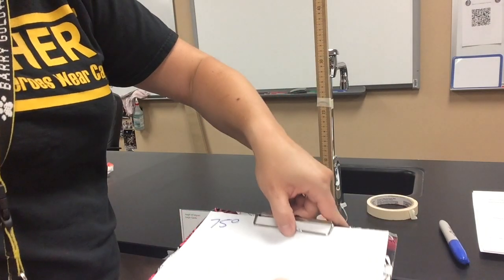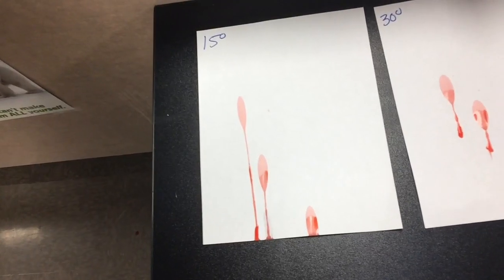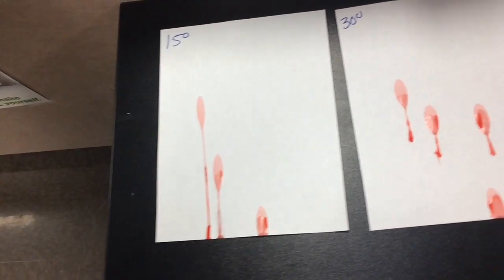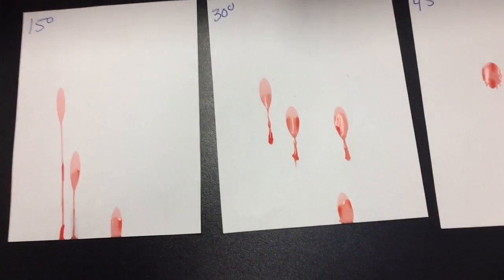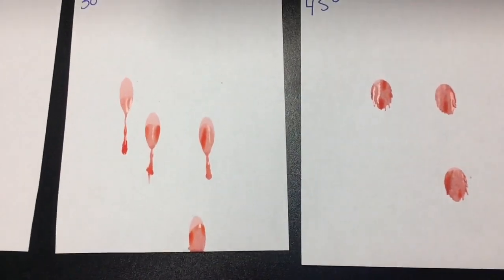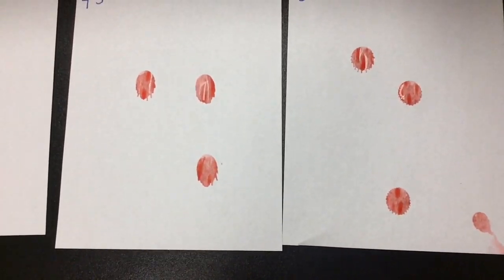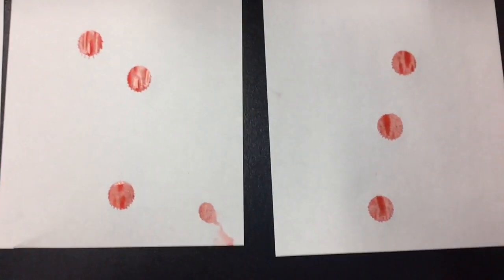So I'm going to let you take a look at all of them one more time. 15-degree drops. This is my 30-degree drops. My 45-degree drops. My 60-degree drops. And then my 75-degree drops.